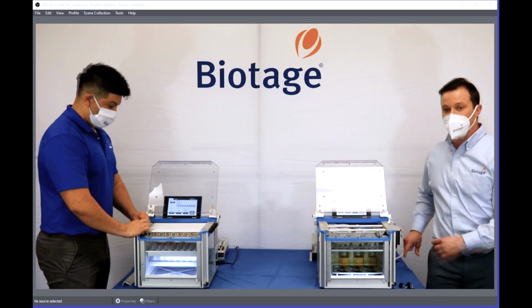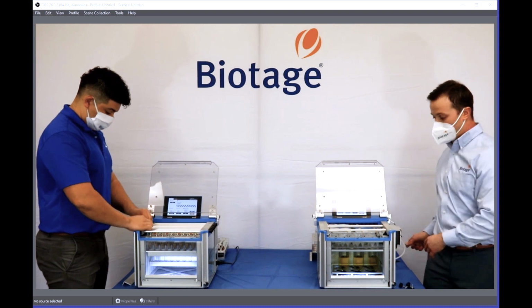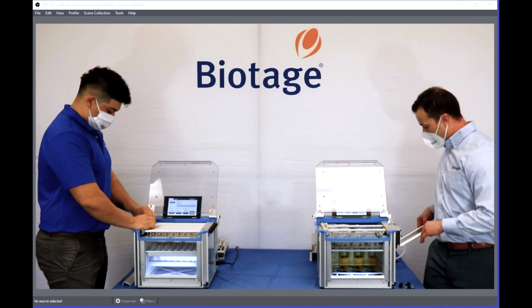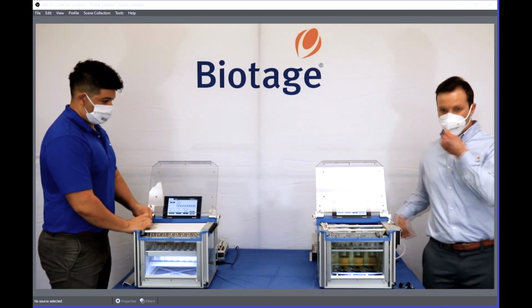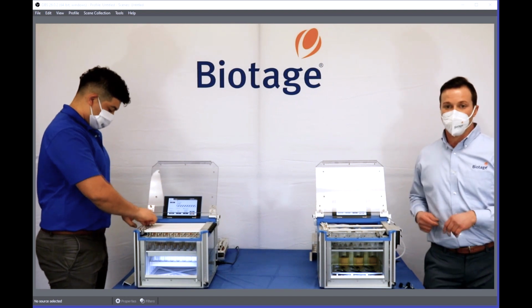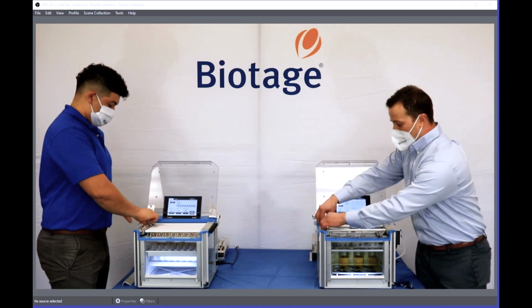So having a gauge is a very cost-effective way of making sure you're getting enough flow. So yes, we do have quick connects, and it is great to have the inline gauge, which comes with quick connects on either side for the tubing.